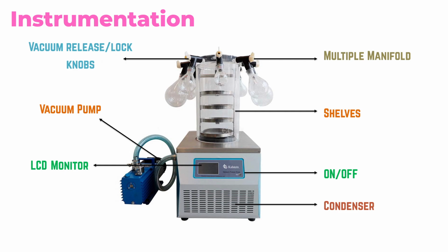Then the next step, the fourth, is primary drying, as we discussed earlier. With the standard operating procedures, first of all you need to start the vacuum pump to create a vacuum, then set the shelf temperature and chamber pressure as per the requirement of the formulation. Then heat is applied to the shelves to promote sublimation of the frozen solvent.